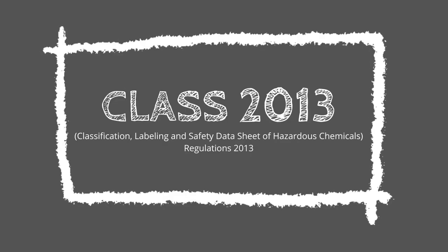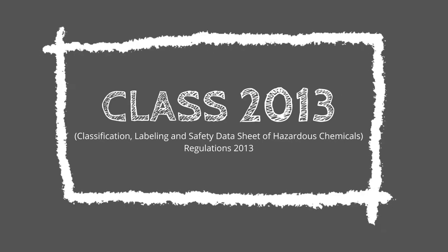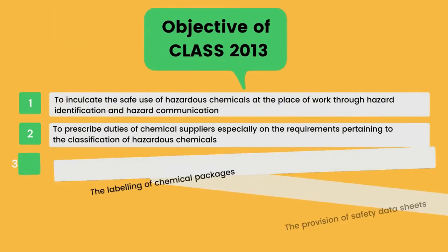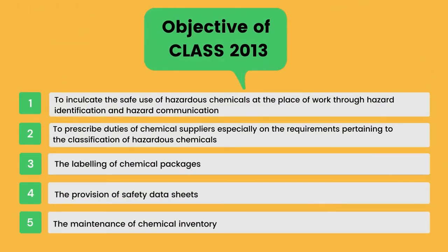Classification, Labelling and Safety Data Sheet of Hazardous Chemicals Regulations 2013, CLASS 2013. CLASS Regulations 2013 was gazetted in October 2013. The objectives of CLASS 2013 are as follows: 1.